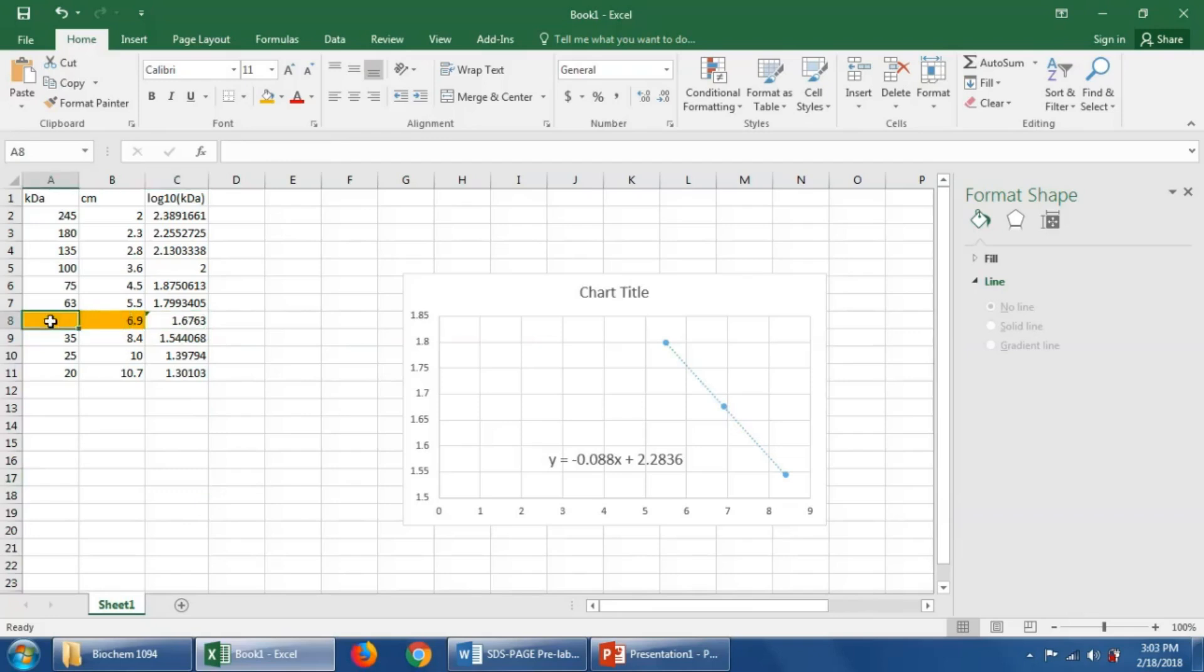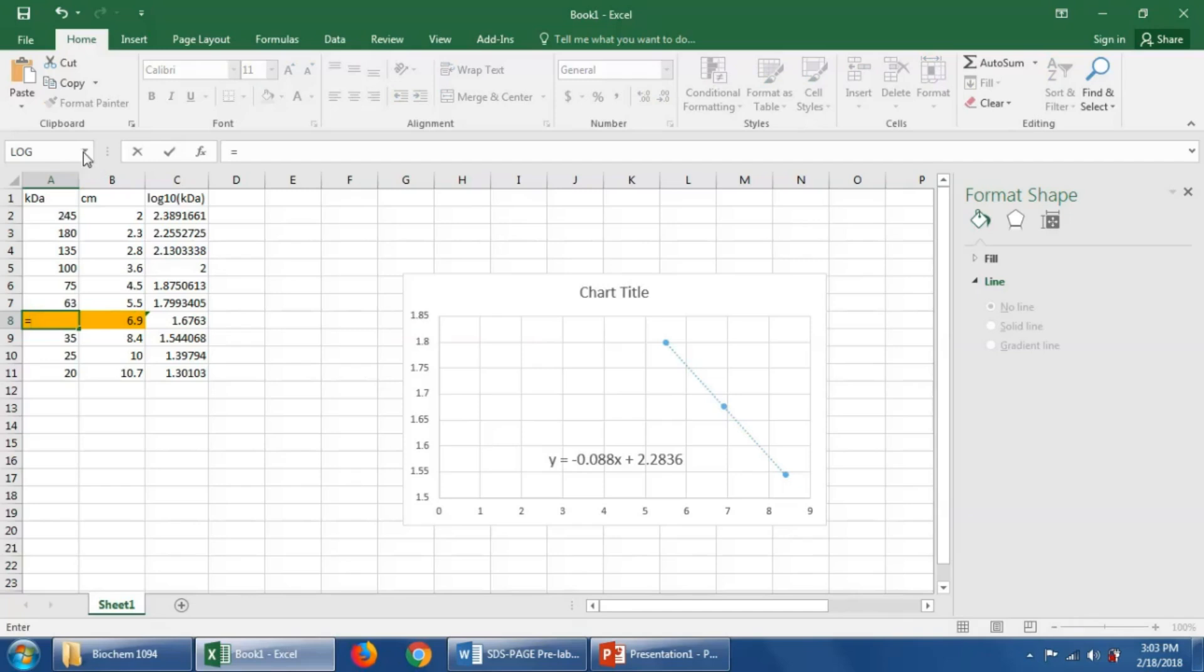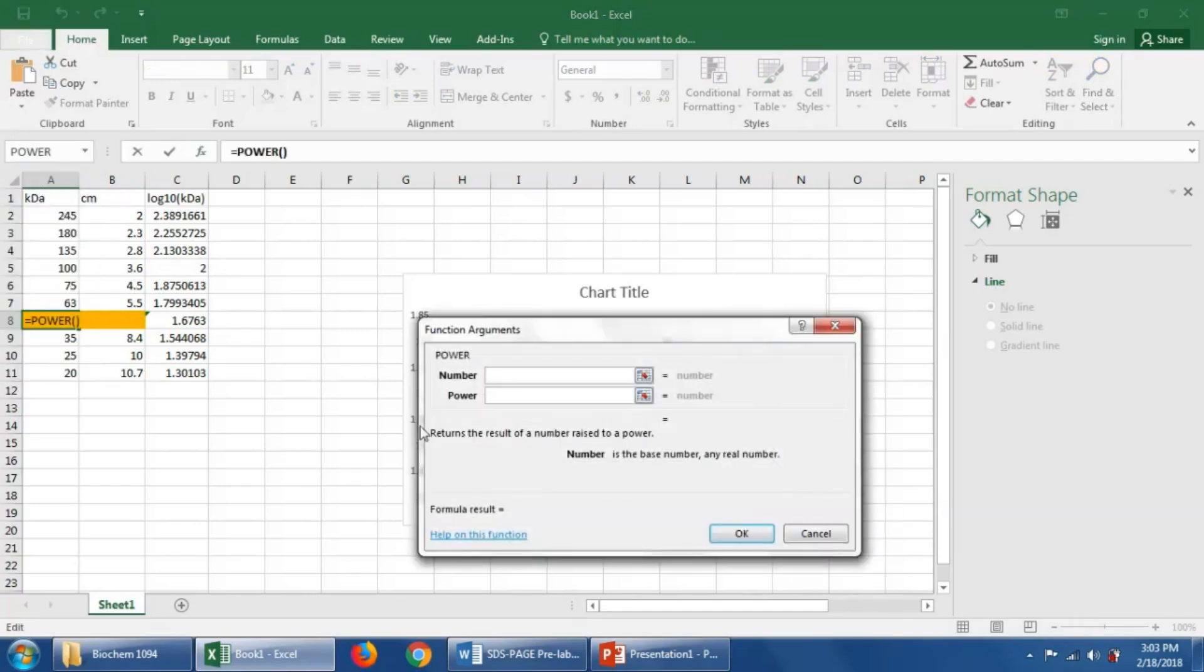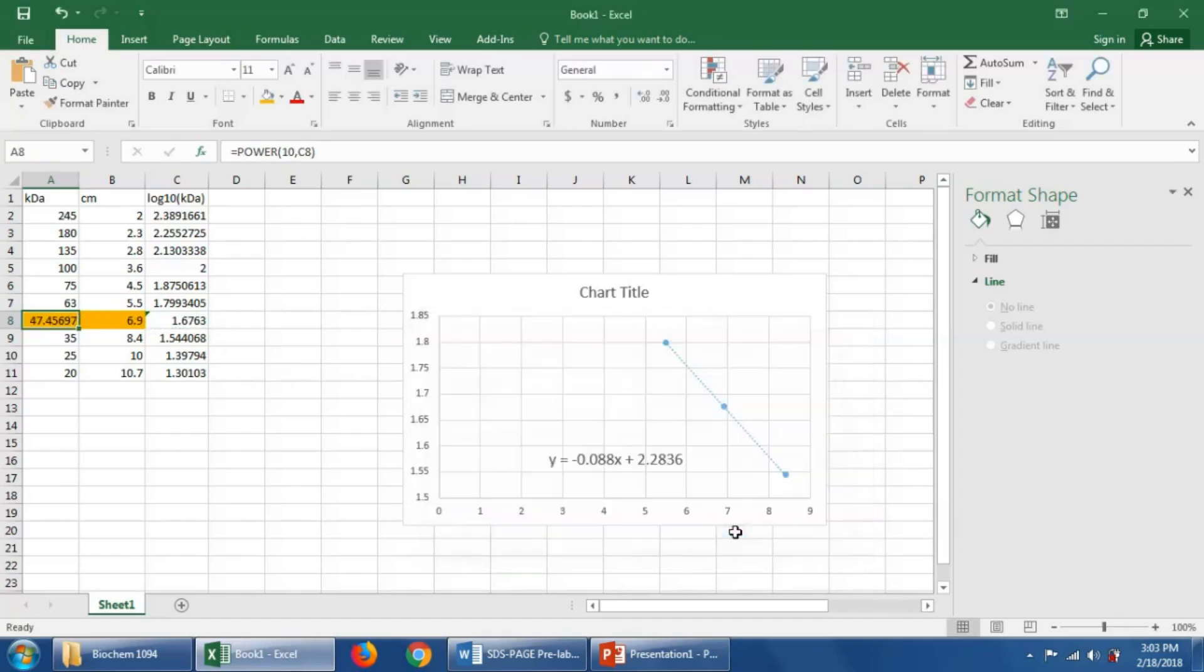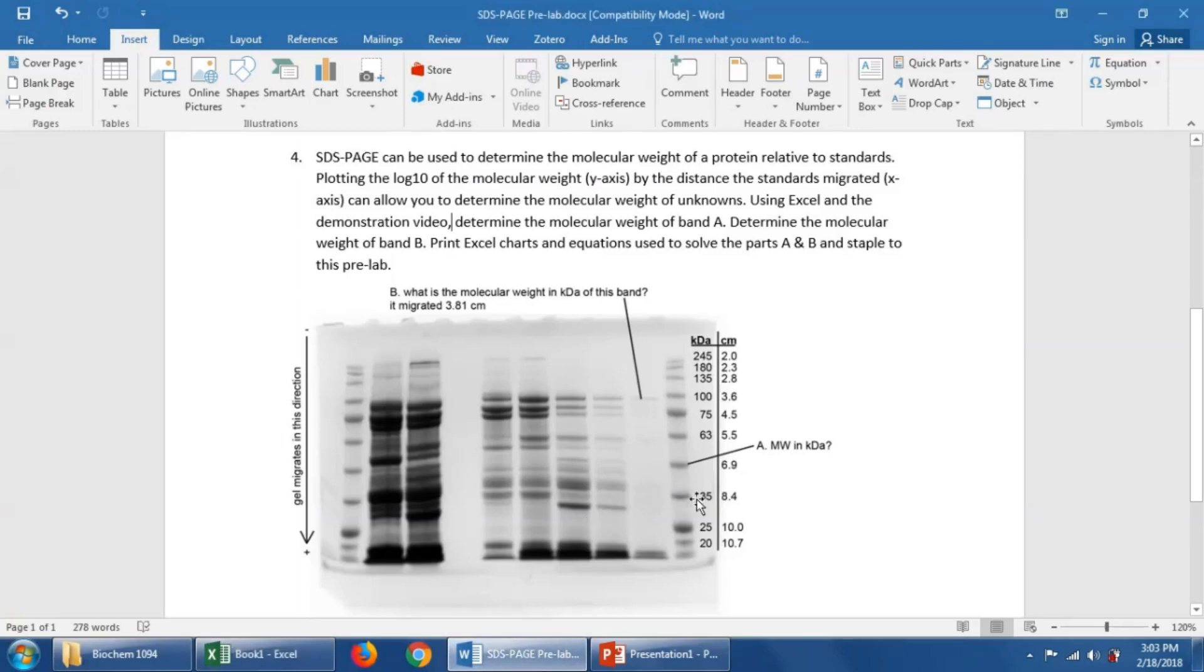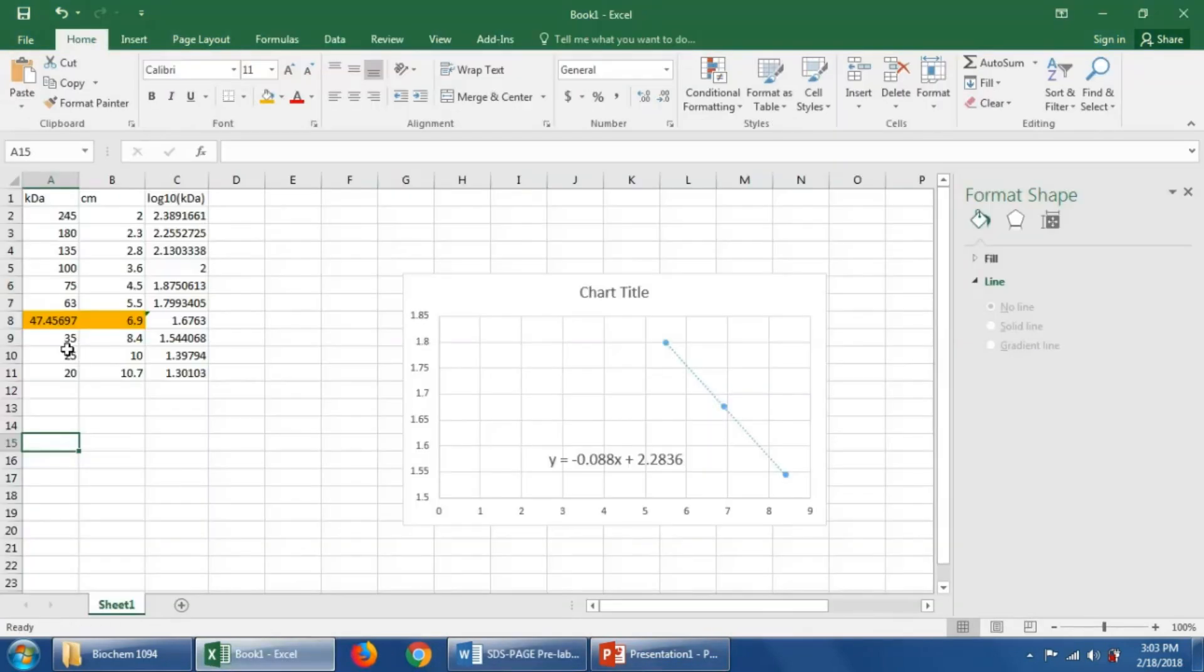Then, of course, we want the real molecular weight. We don't want the log base 10 of that. So we could say equals power. And we could do, so we're going to do the opposite of the log base 10, which would be 10 to the power this cell. And so here we've calculated that band A, this band A right here on this gel that migrated 6.9 centimeters, is 47.4 kilodaltons.